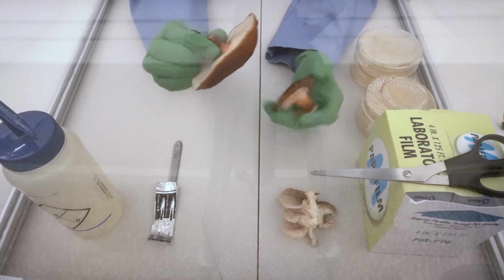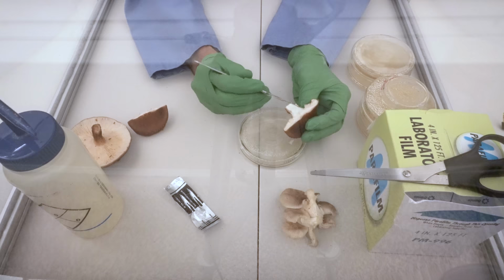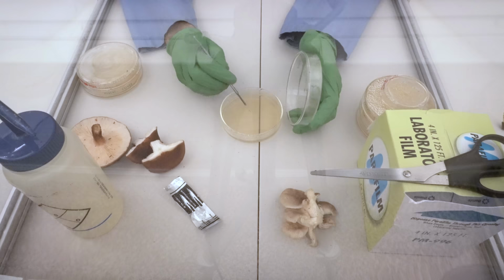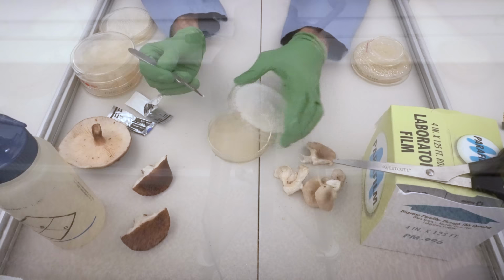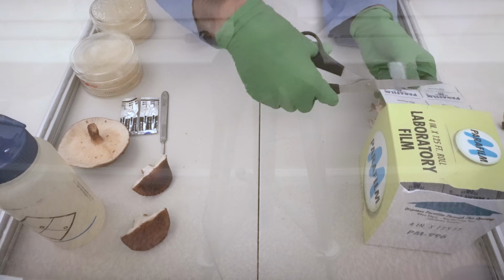We can now rip open the mushroom to expose the inner sterile tissue. This is where we can use a sterile scalpel to subculture small samples to inoculate the agar growth media. Our goal is to isolate and grow only the mushroom fungus. Since contaminating microorganisms are ubiquitous, using these aseptic techniques improves our likelihood of growing the mushroom fungus free from contamination. Paraffin film is used to seal the plates and protect them from contaminants after they're removed from the hood.